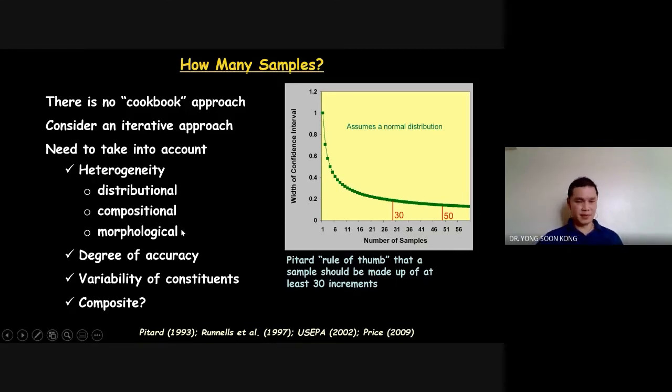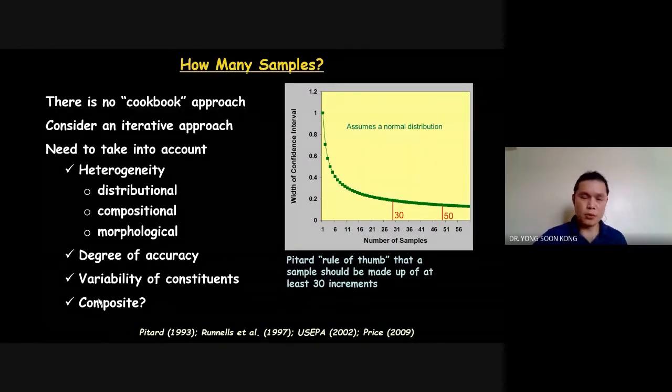By the way, I'm sure you have heard this word before: composite. In water sampling, I'm very sure you've learned Dr. Nick's lesson. There is one sampling method called composite sampling. If you forgot what composite sampling is, it is as simple as taking several sampling points, mixing them together, and making one sample. That is called composite. Why do we do that? Because when you take four replicates, they may be different. So in order to average out all the so-called little differences, you mix them together and take one. This is actually very similar to the quartering method that the soil subject has.